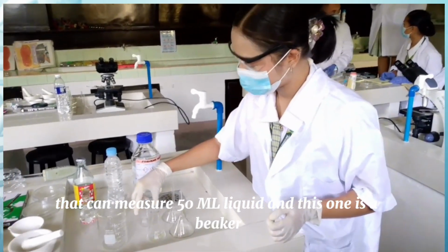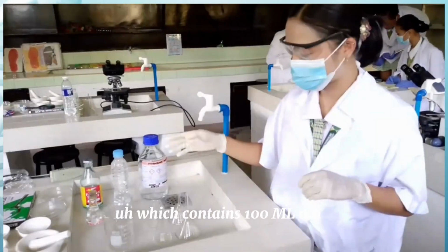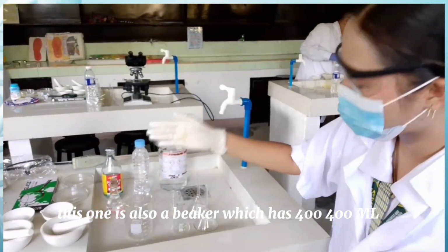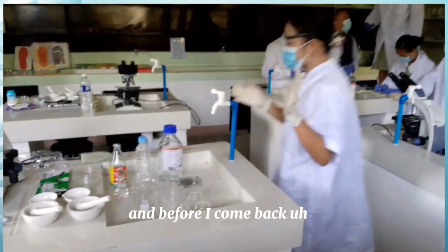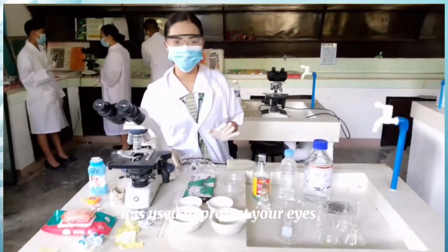And this one is a beaker, which contains 100 ml. This one is also a beaker, which has 400 ml. And before I forget, we would like to introduce you to the goggles. It is used to protect your eyes.